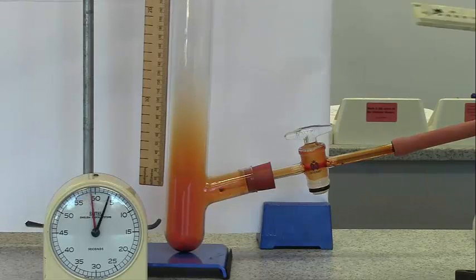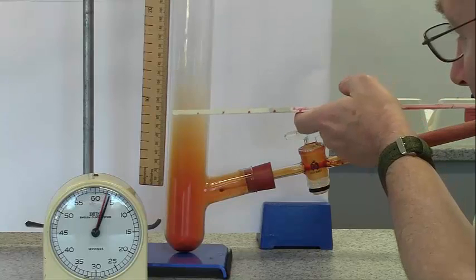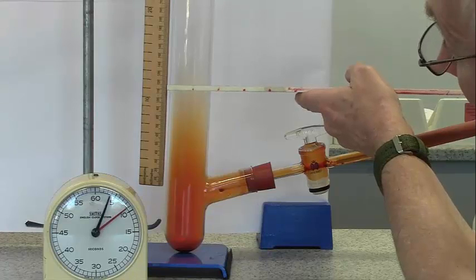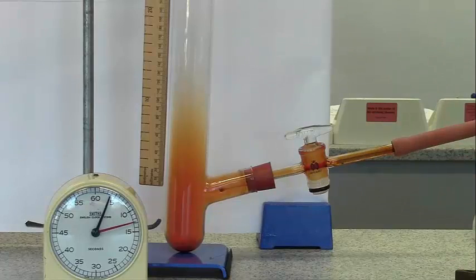And now after three minutes - twice as long - it's probably around here, which is about 12 centimetres. So it doesn't seem to have a constant speed. It seems to be slowing down.